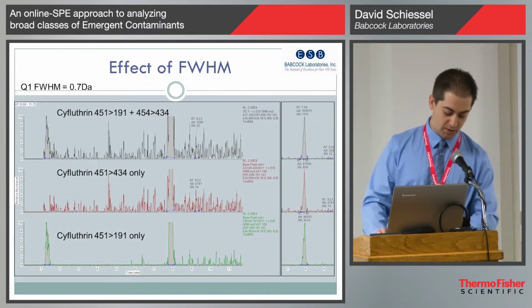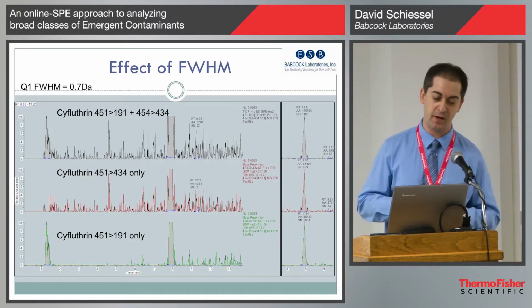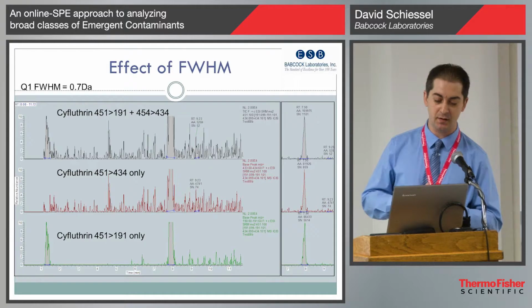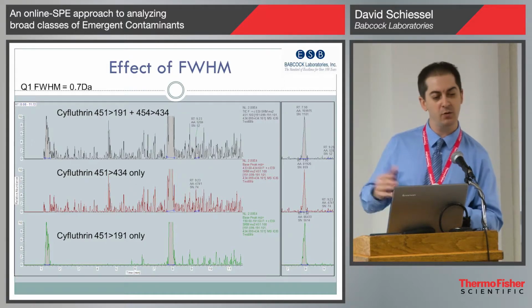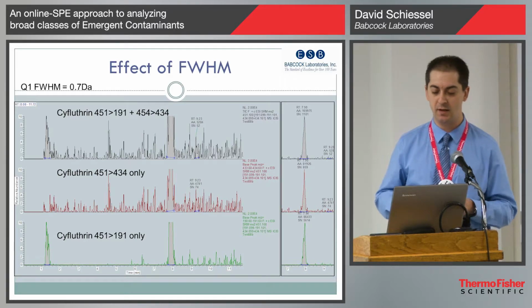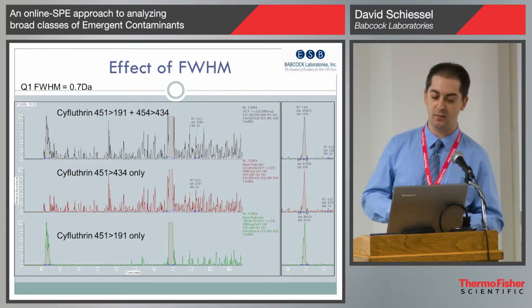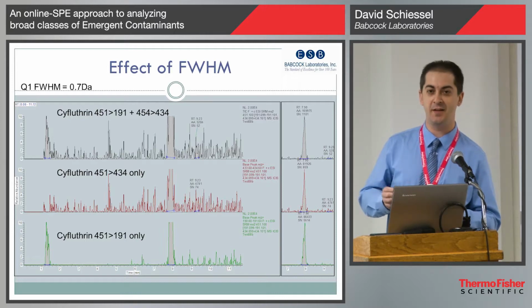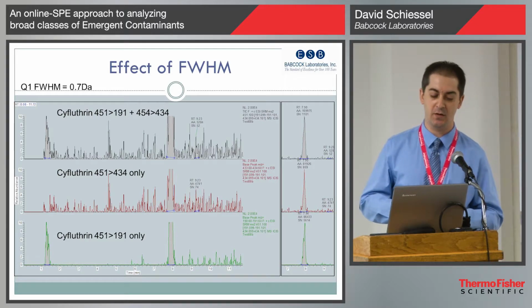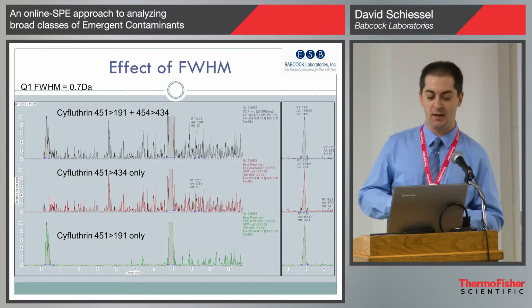Just as an illustration of what we've done to minimize matrix effects using mass spec: we had an issue running hormones for EPA method 539, and we were seeing some low-level testosterone and androstenedione hits in finished drinking water. If you know that method, it's not a very good method. It's really a screening method with one transition that you're monitoring. So the question became, is this really testosterone at 0.1 ppt or not?